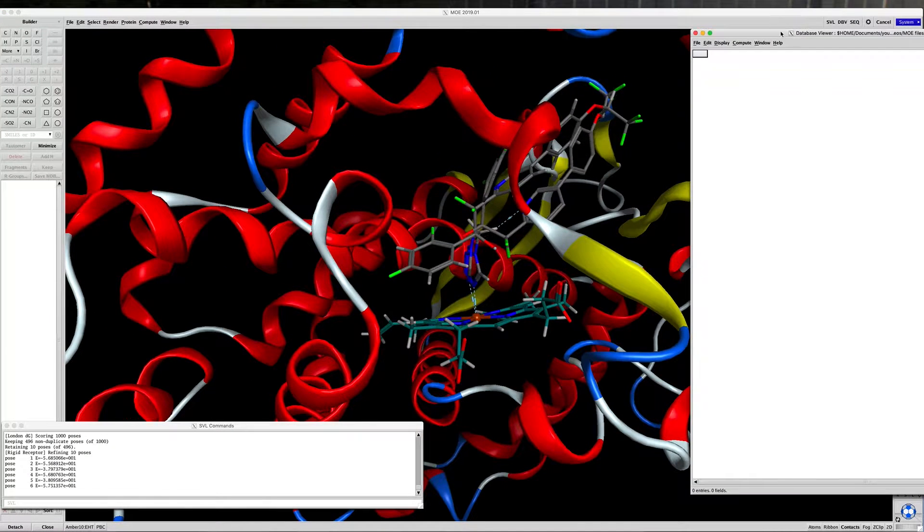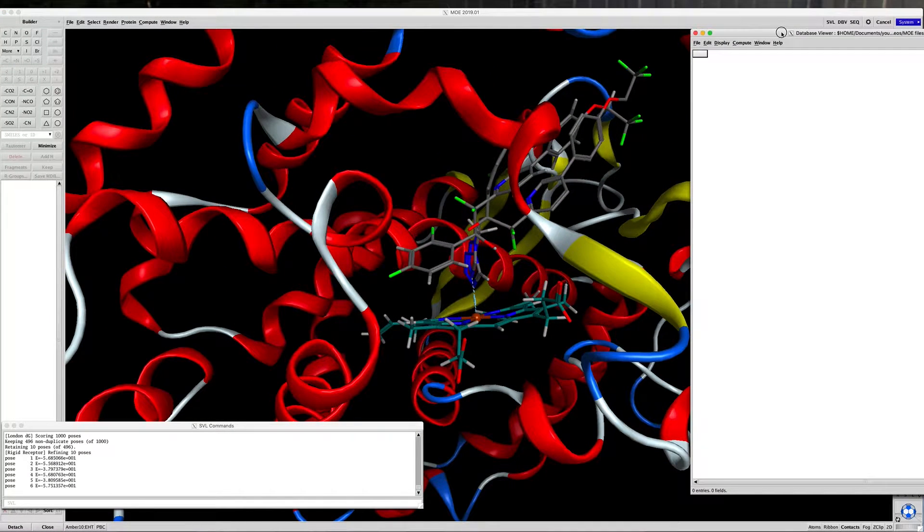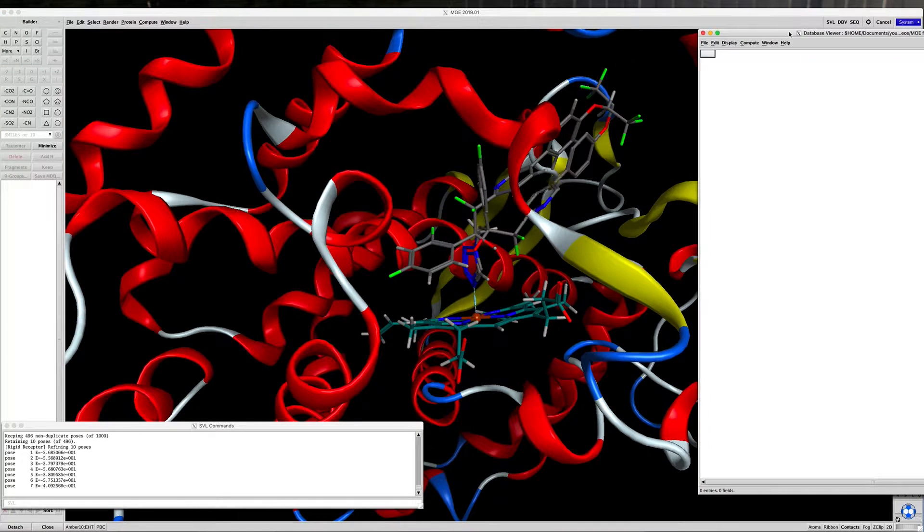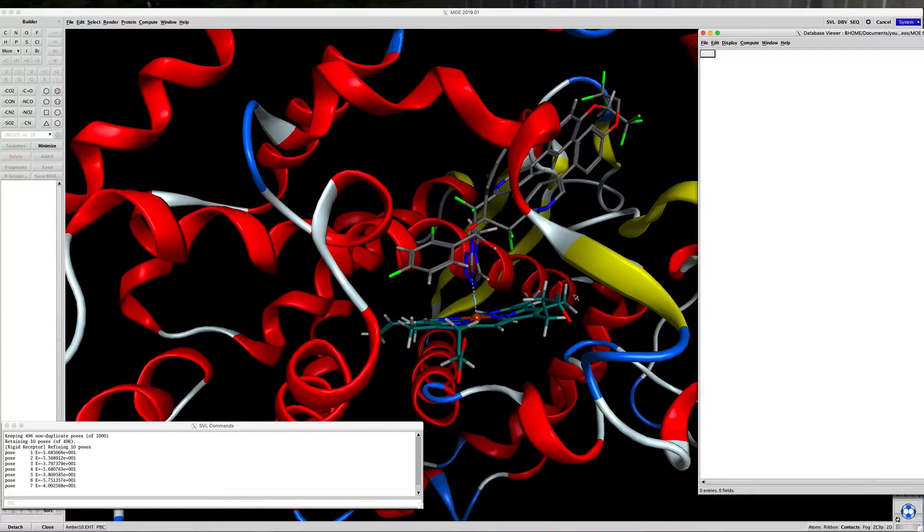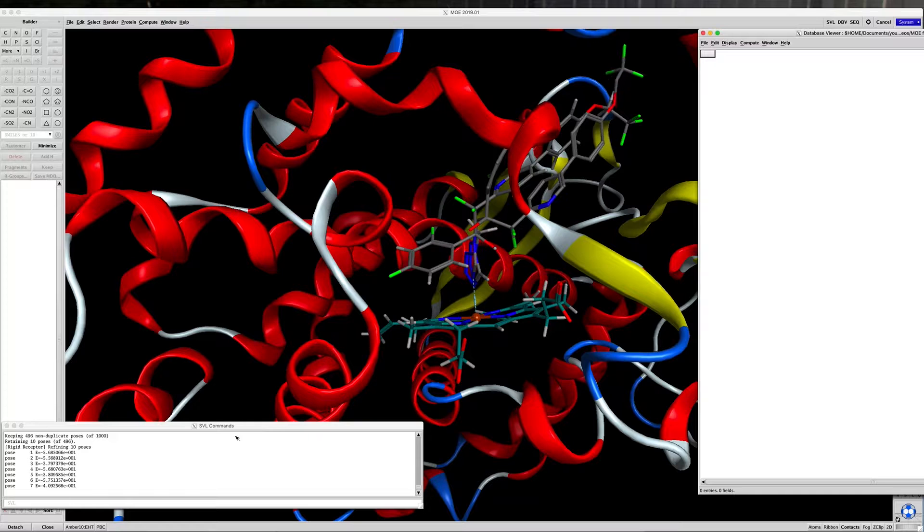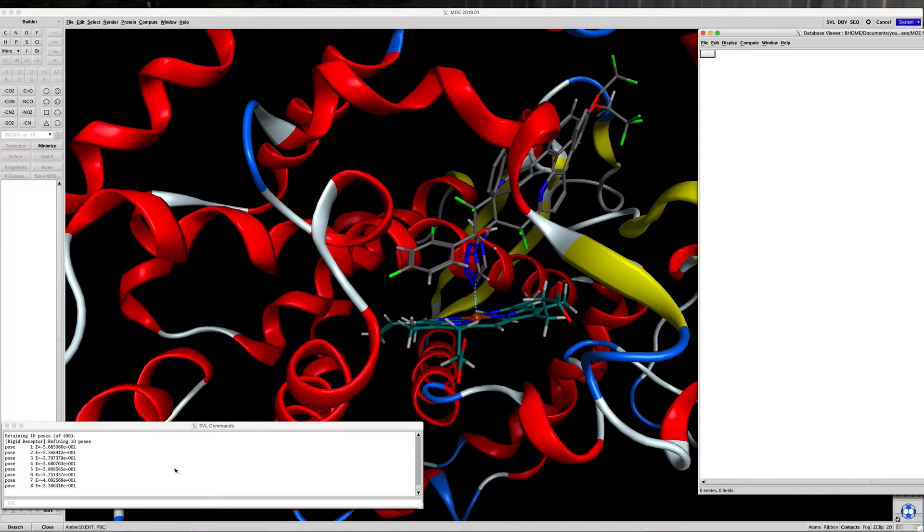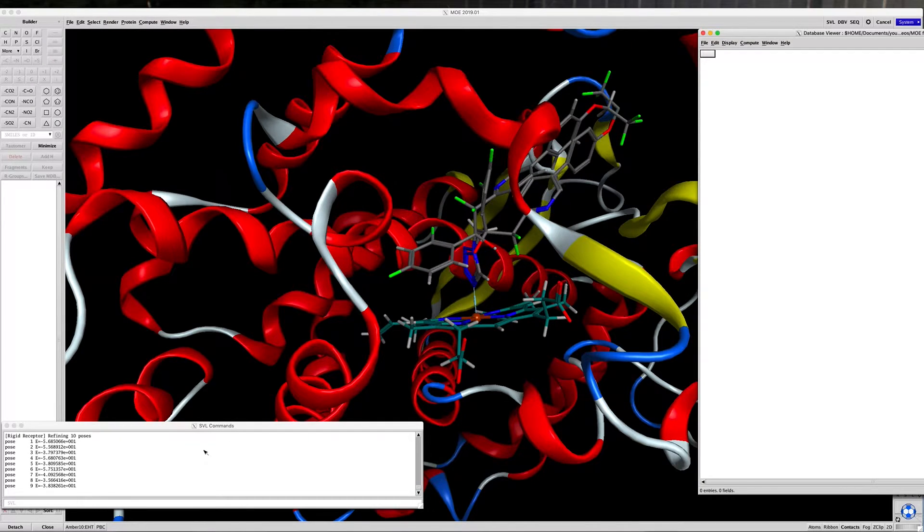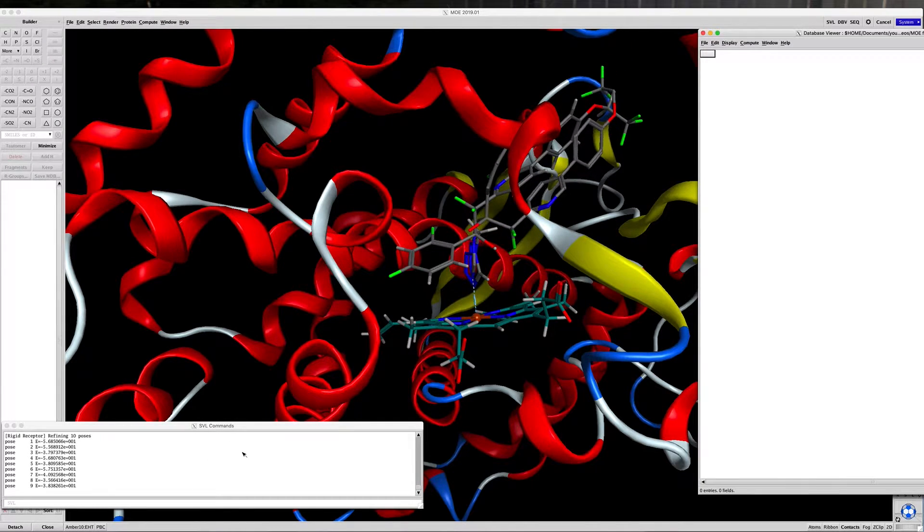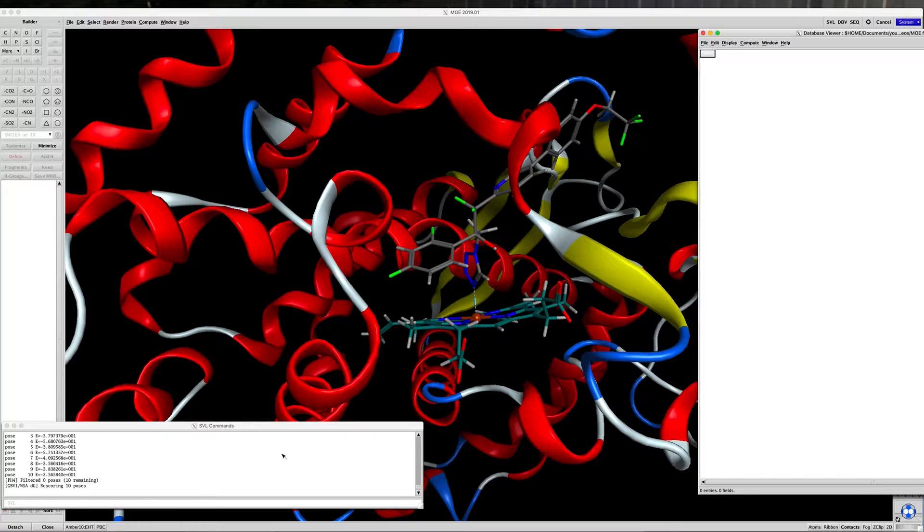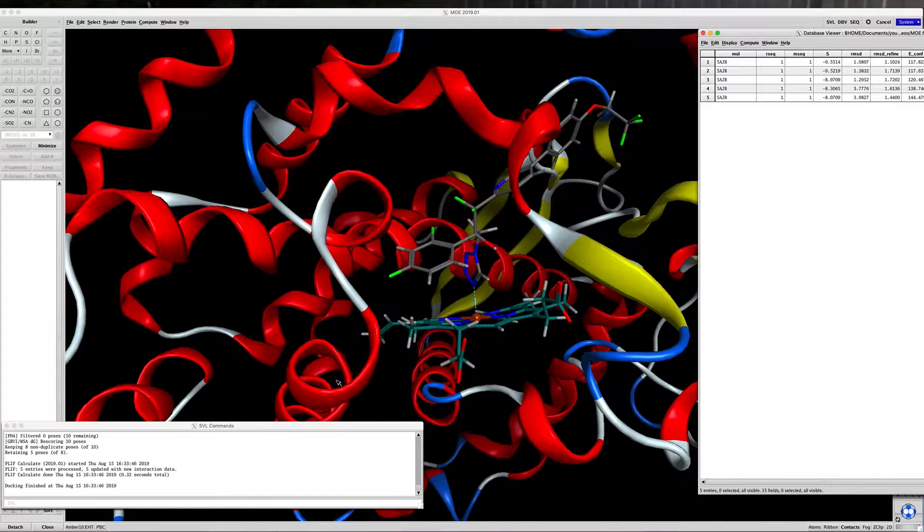So we're going to wait for that to come up. The database viewer is here. And as soon as this finishes, which should be shortly, we'll take a look at these poses and see how well they compare to the crystallized pose.